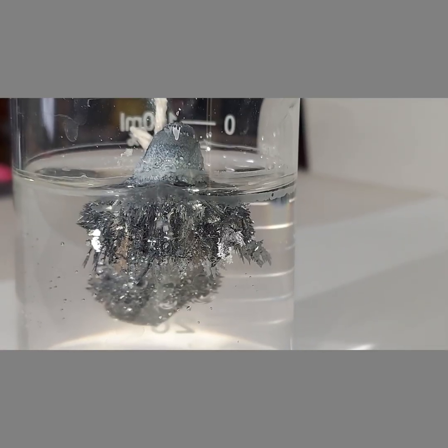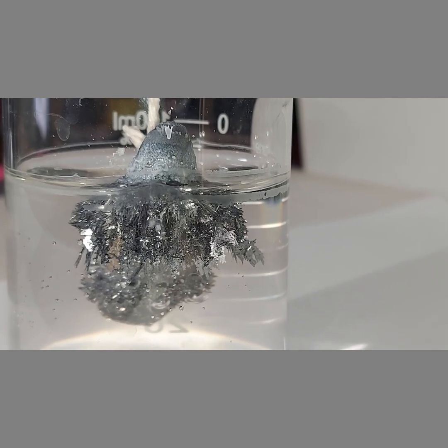This is around 20 hours later and we can clearly see the lead crystals drooping down just like they're supposed to.